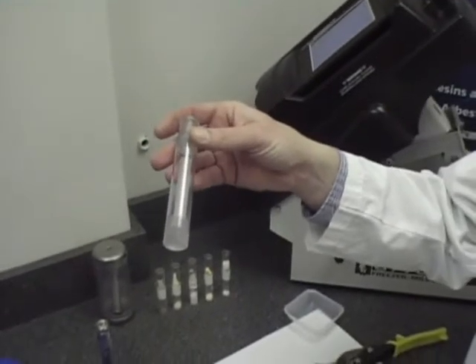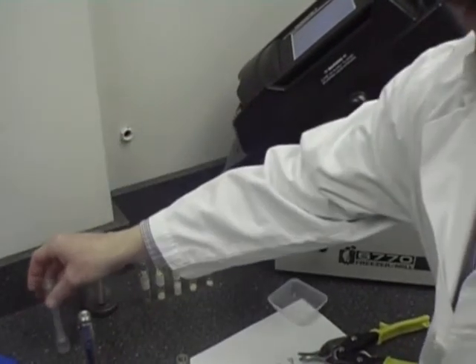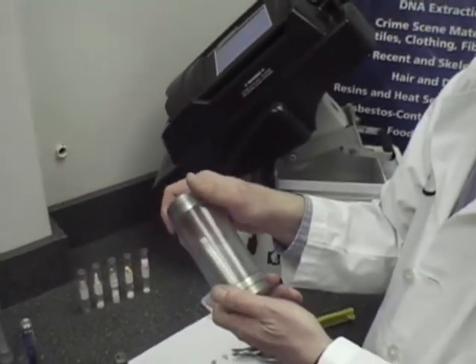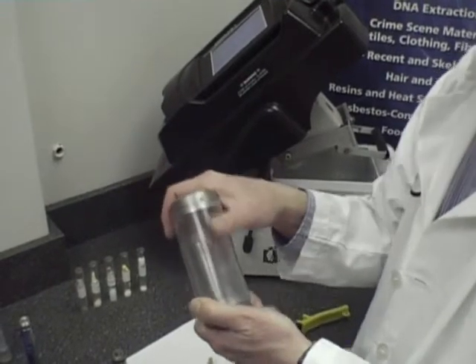We also have a poly vial for those samples that cannot be contaminated with metal. And we have a large vial, which is used in our 6870 Freezer Mill, capable of handling much larger samples, up to 100 grams of material.